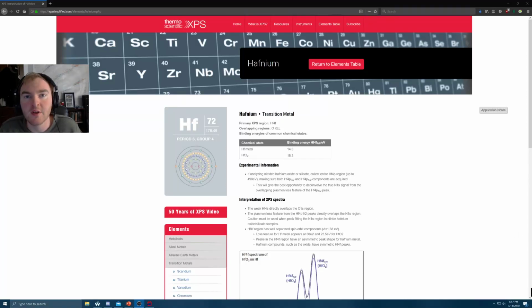I'm a grad student at the University of Rochester, and today I'm making this recording for future grad students in the department to do a summary of using the XPS to do depth testing in materials, that is, to get elemental compositions at different layers of a sample. So I'm going to go through resources that are available that are free to help you quantify and understand the data that you're taking.